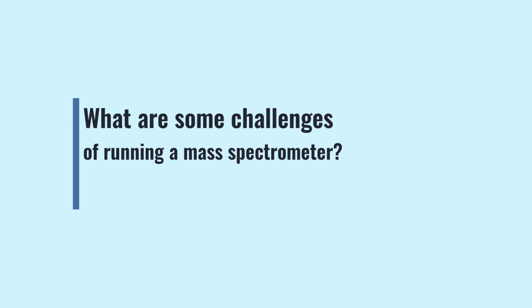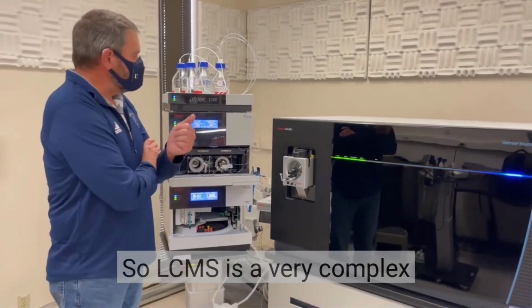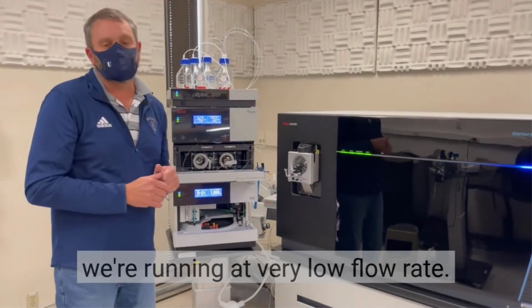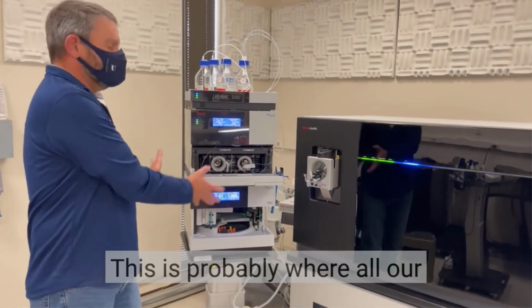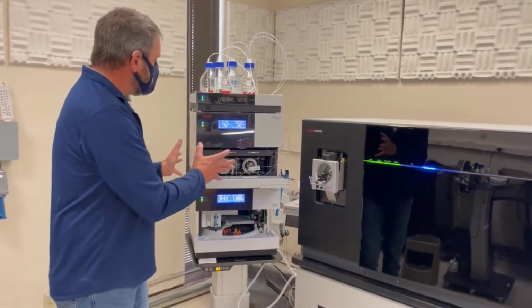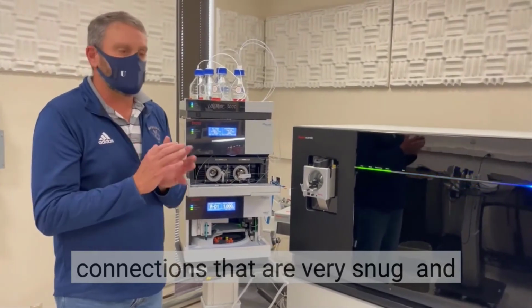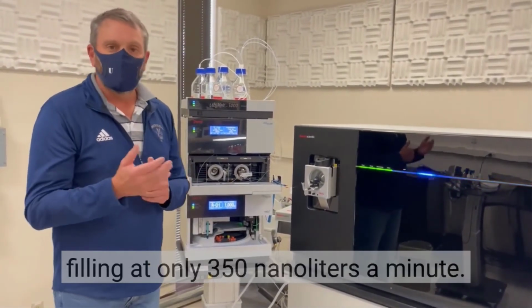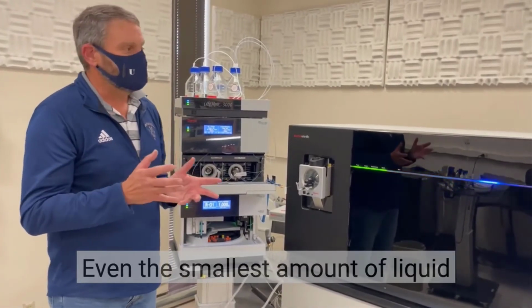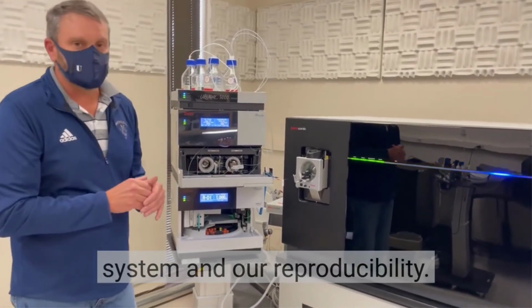What are some challenges of running a mass spectrometer? So LCMS is a very complex instrument. You can see that here. We're running at very low flow rates. This is probably where all our failures happen, mostly in the LC. That's because we have to have connections that are very snug, and we can't lose any liquid when we're flowing at only 350 nanoliters a minute. Even the smallest amount of liquid change or leak in the system affects our reproducibility.